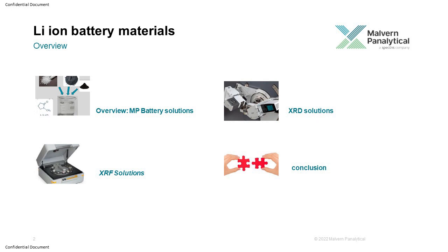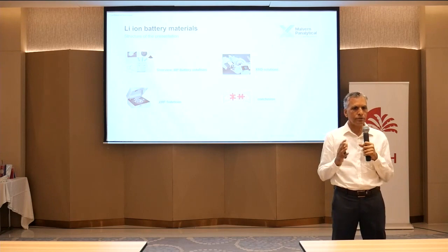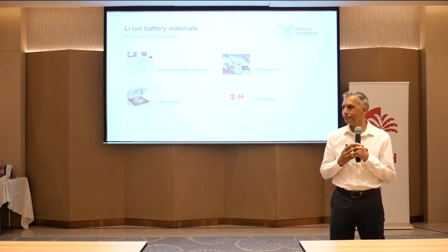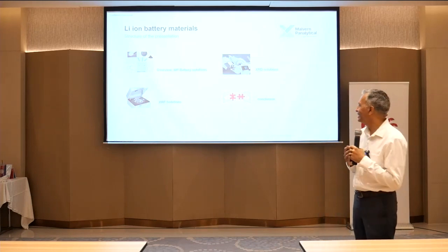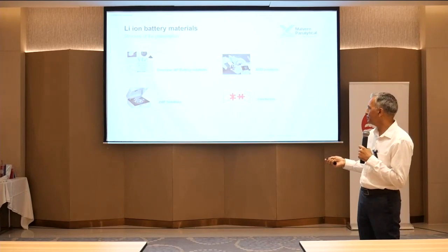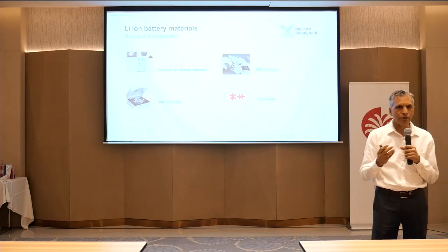I will give you a brief overview of our overall solutions within the battery research and R&D, and production. Then I will come to the XRF solutions and the XRD solutions, and finally some concluding comments.